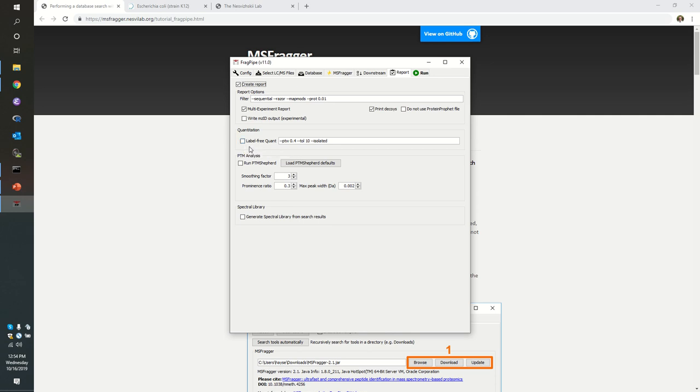You can do the same thing here in FragPipe. I am not, however, going to check it. And the reason for this is that it takes a bit more time to sniff through these raw files and reconstruct chromatograms for each peptide. In this case, we're going to leave it aside and stick with spectral counts in this context.